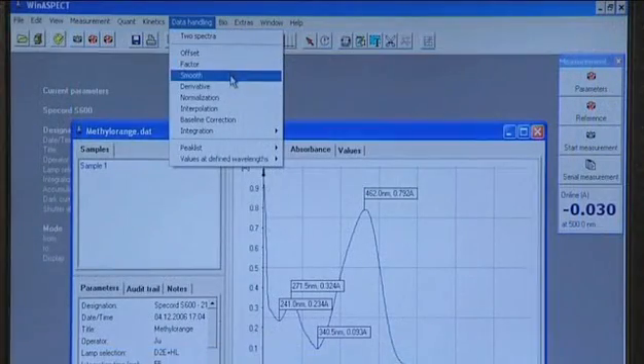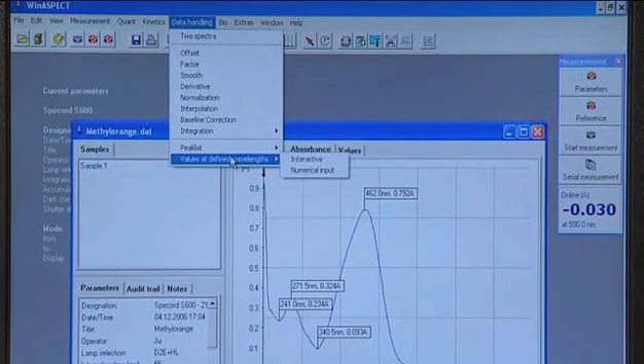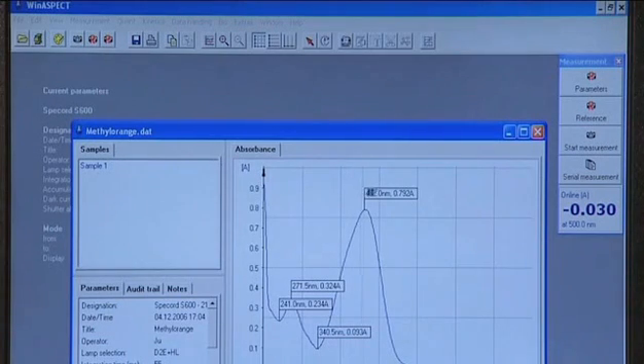The data handling module allows evaluation of the measured spectra by mathematic functions — in case of fixed wavelengths by automatic peak finding or an interactive wavelength selection; in case of a more extensive spectral range by smoothing, derivatives, integration or standardization.